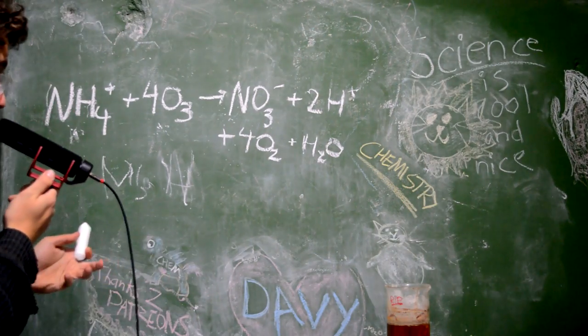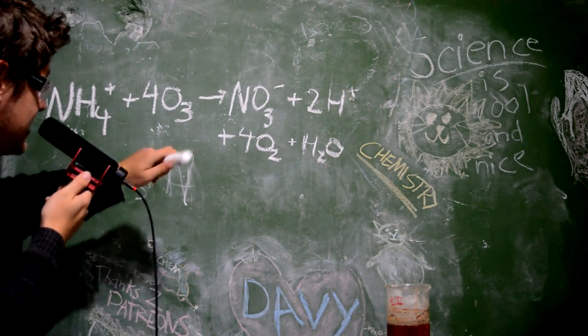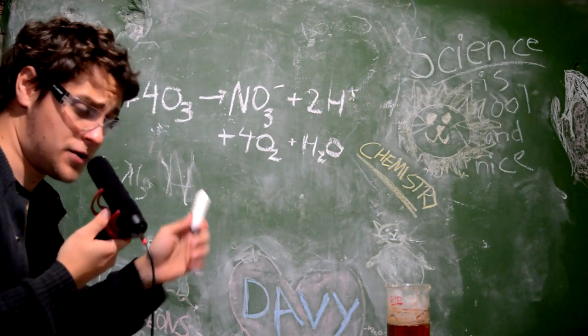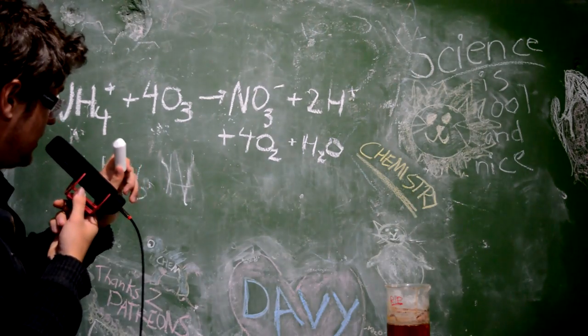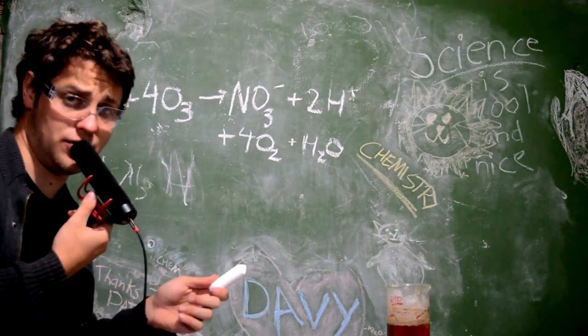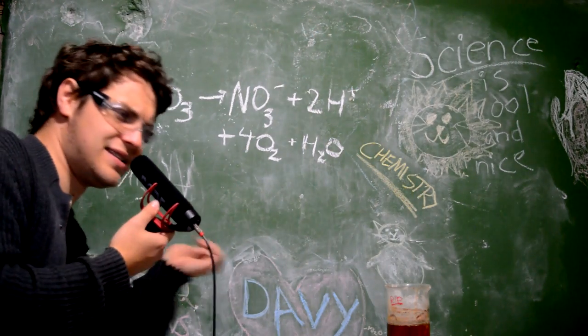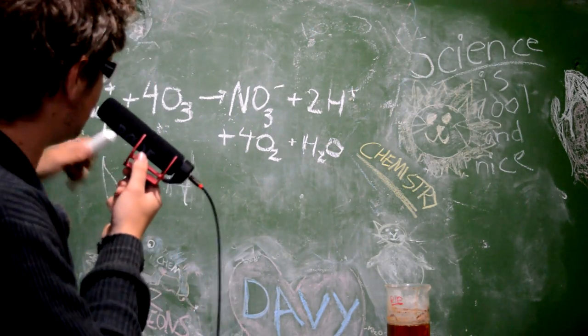Either one of them could actually be the dominant process, but I'm hoping it's this one because otherwise there's no reason not to build a Birkeland air reactor. So I've got some concentrated ammonia solution already, and I'm just going to get that out and start running some ozone through it. But I'm sure things are going to get complicated. They always get complicated. It's not an Extractions video if it was just straightforward.